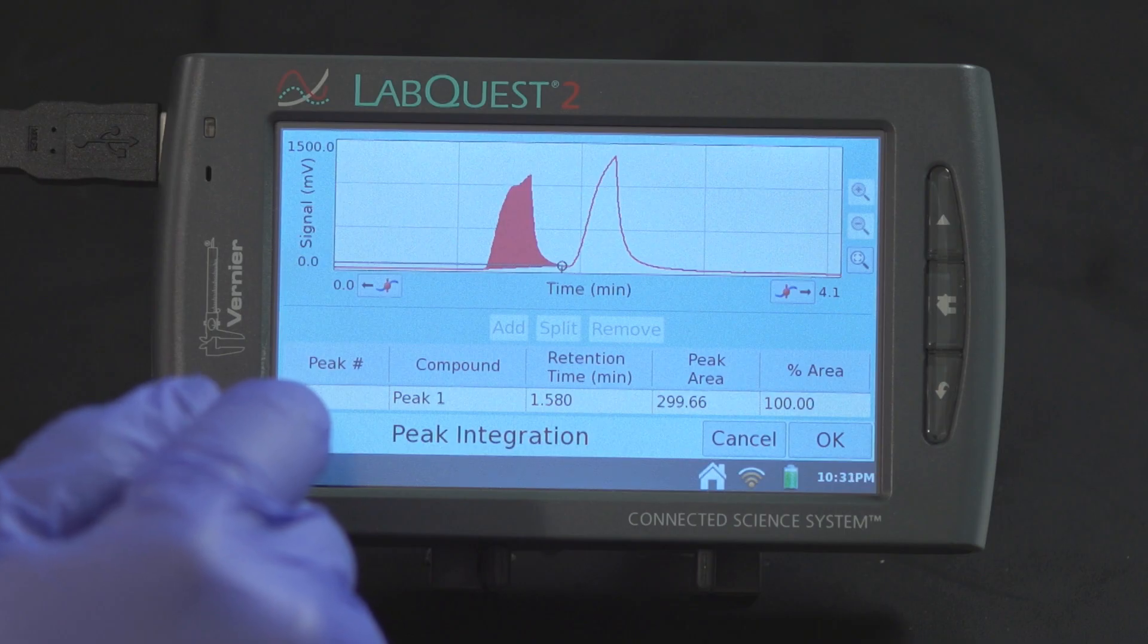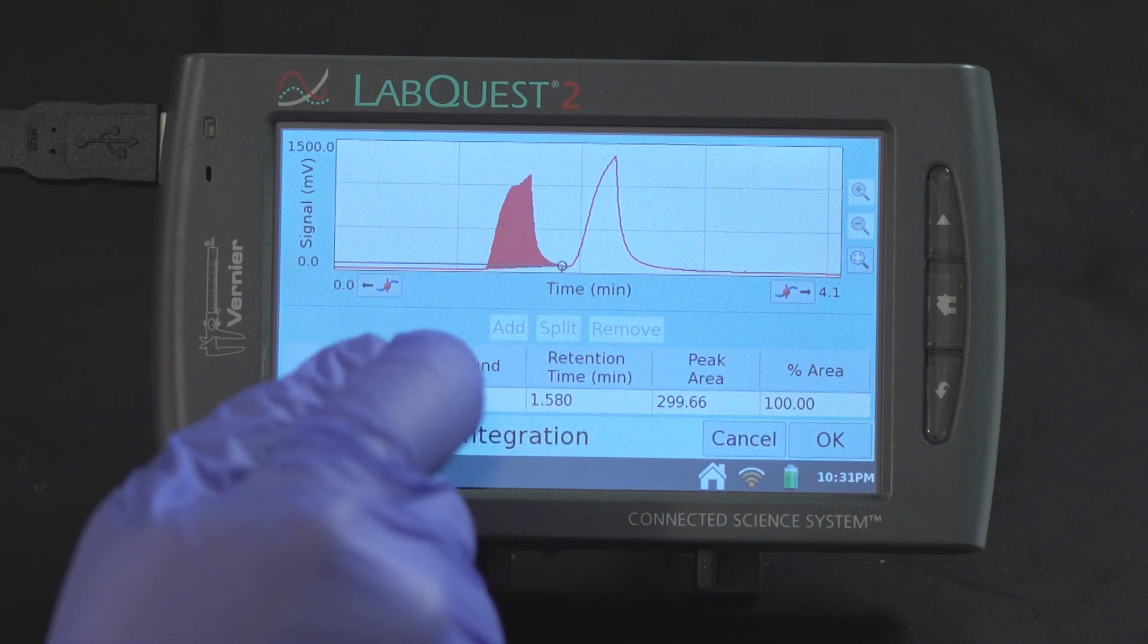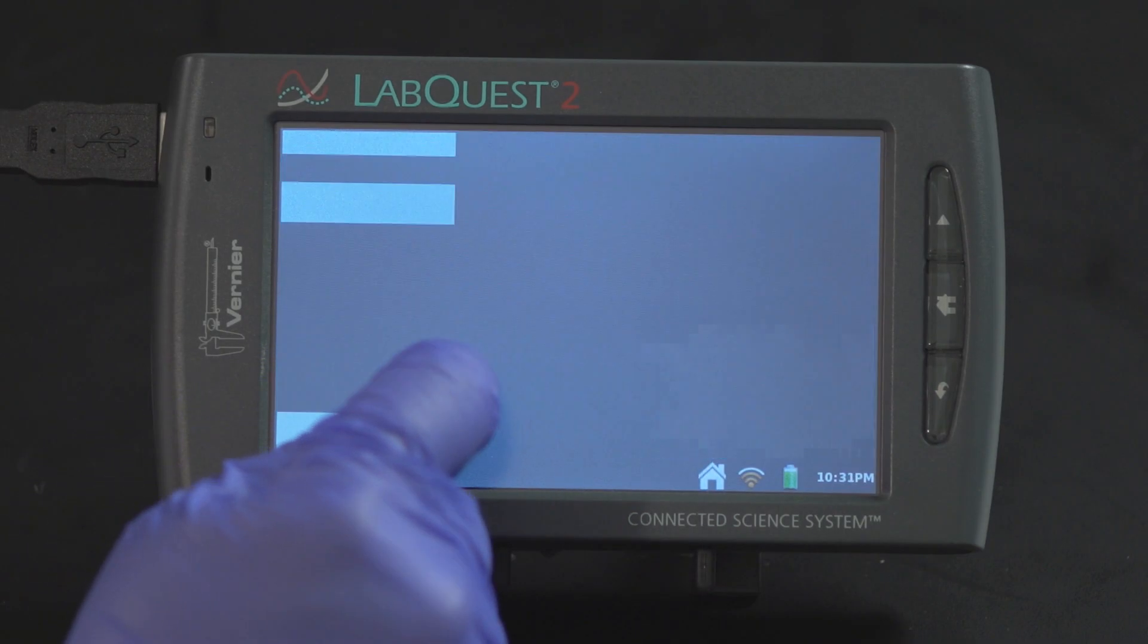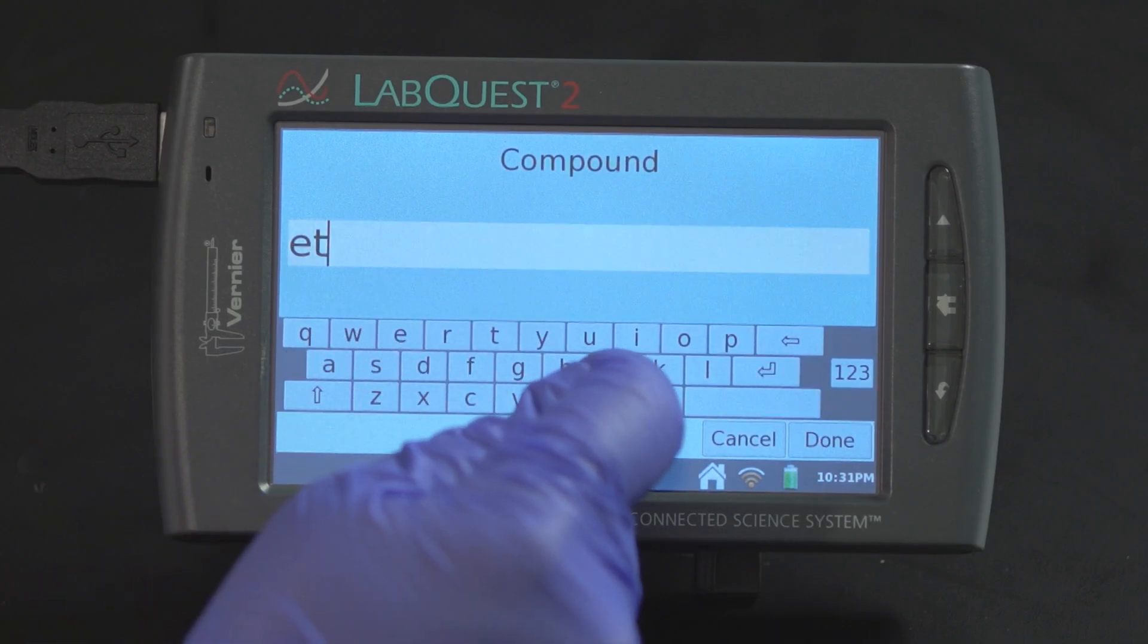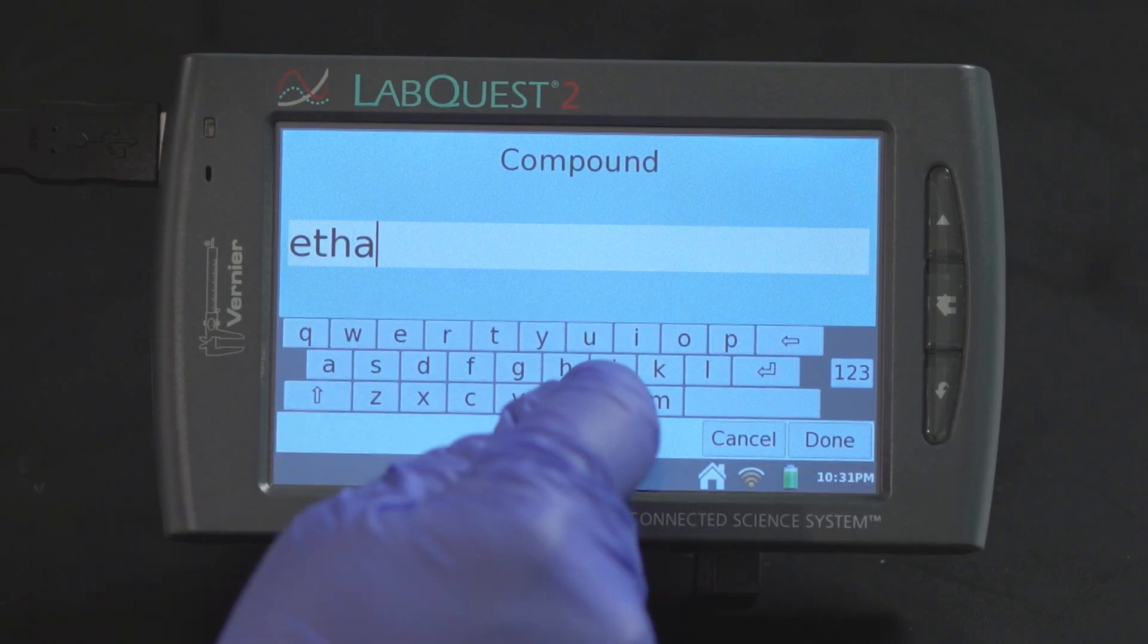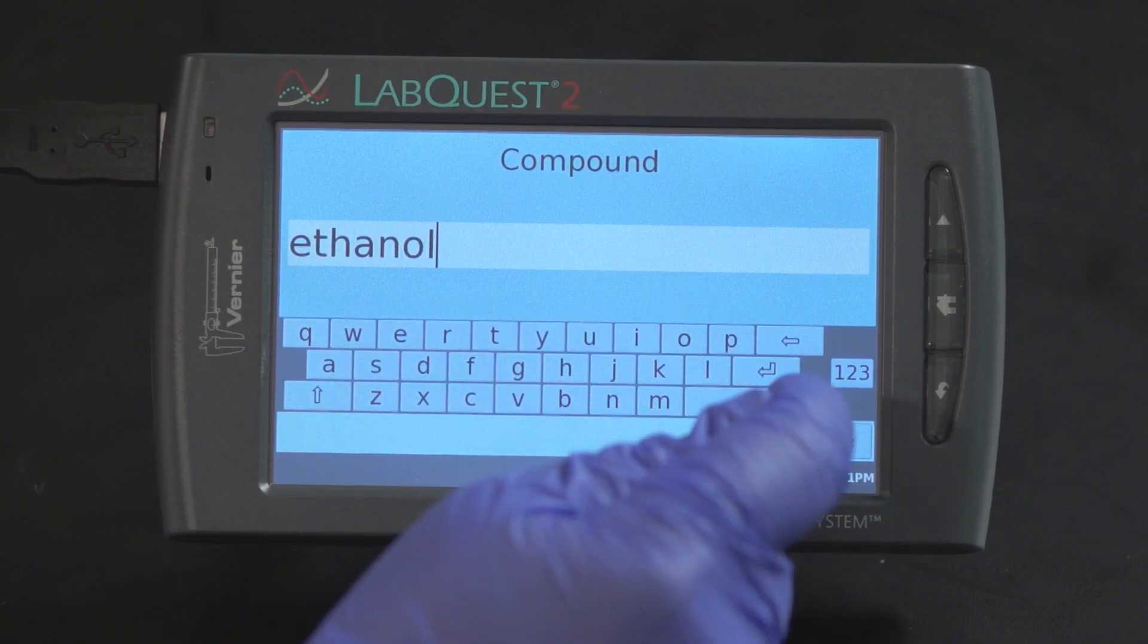Enter the name of the compound if known. Tap twice on peak one and type in ethanol. Choose done.